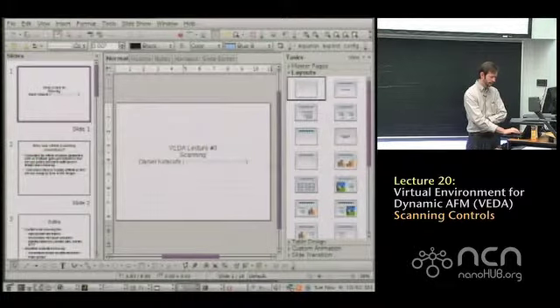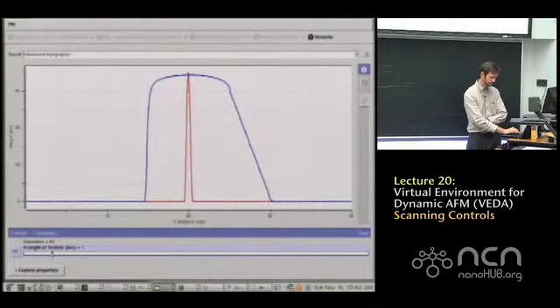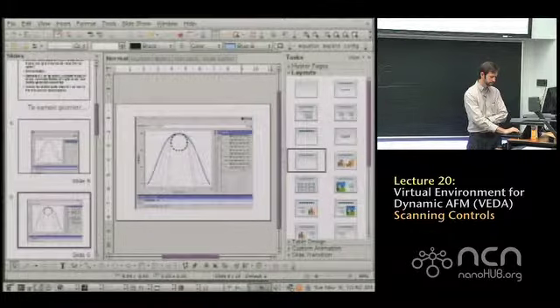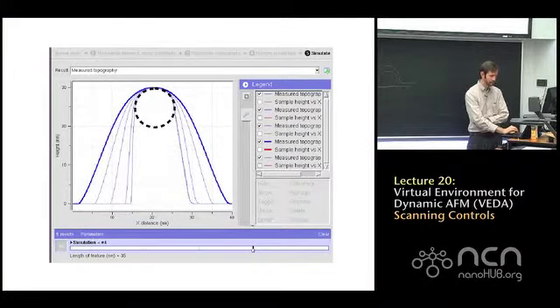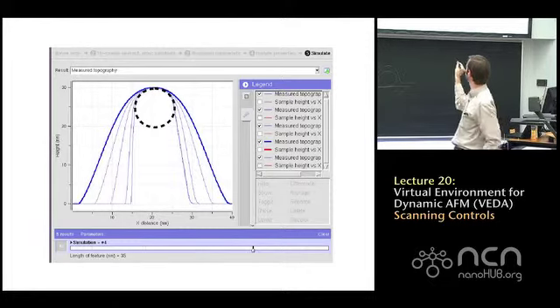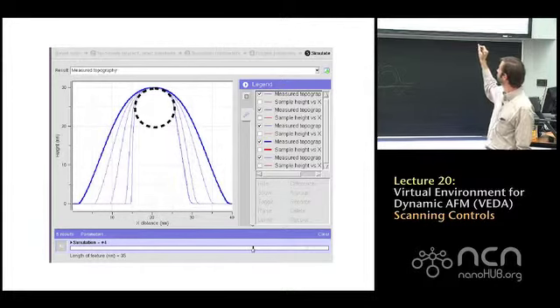But if I were to put these guys together and put it on an aspect ratio where this axis and this axis are the same, you'll notice you can inscribe a circle right inside that one.